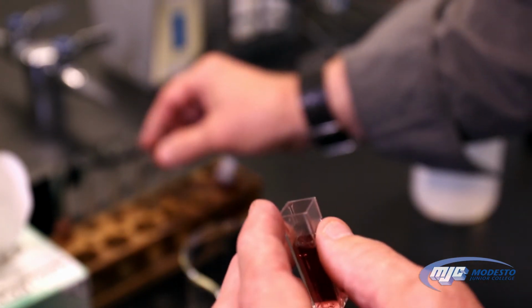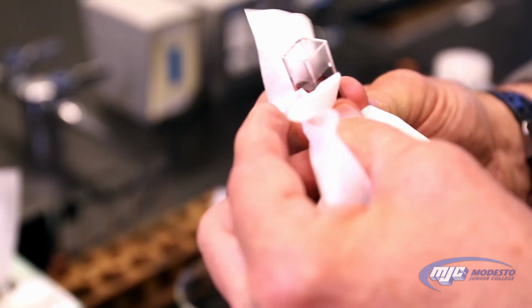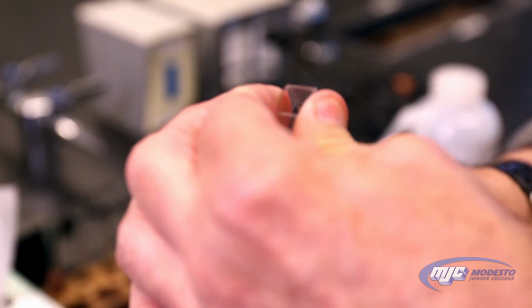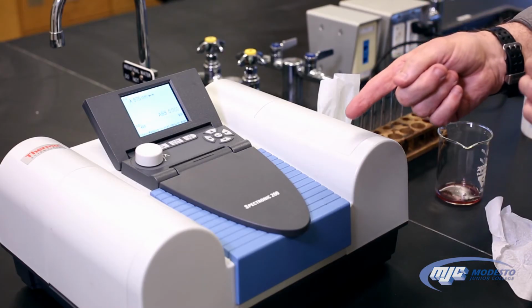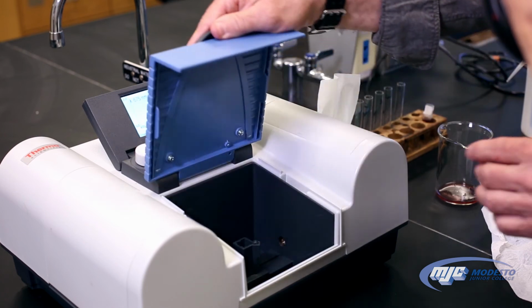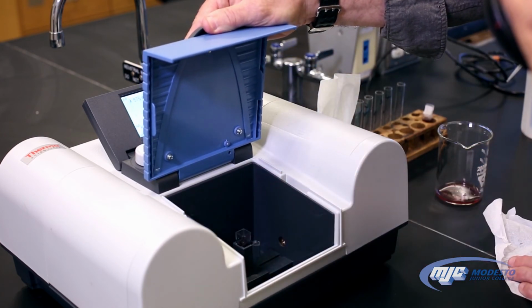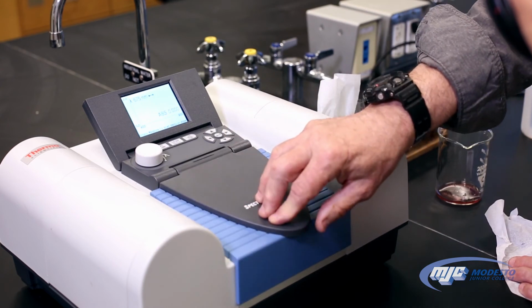Just about that much is good. As always, we wipe off the outside with a Chem wipe. We're going to put it into the spectrometer now. So we open up the door, place it right here. Now we're ready to go.